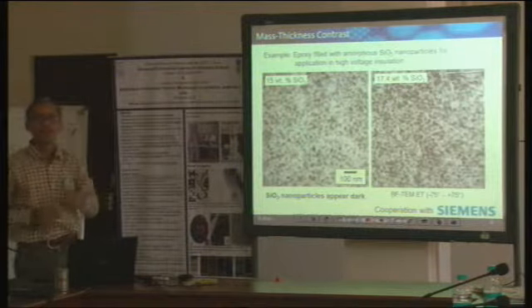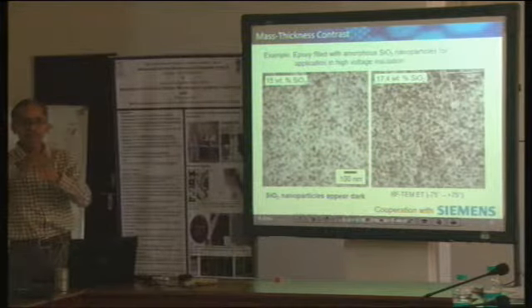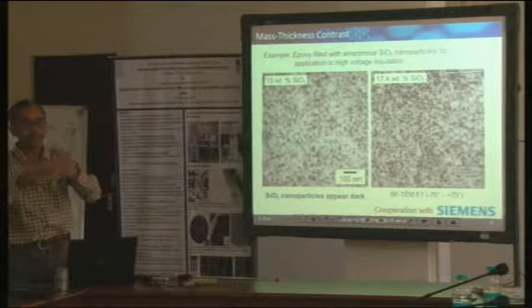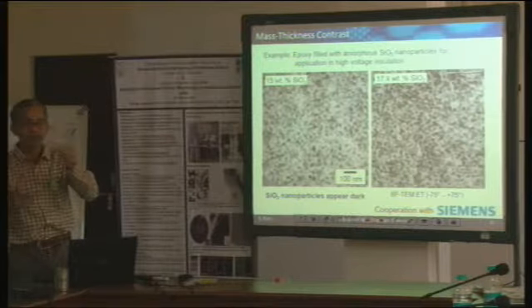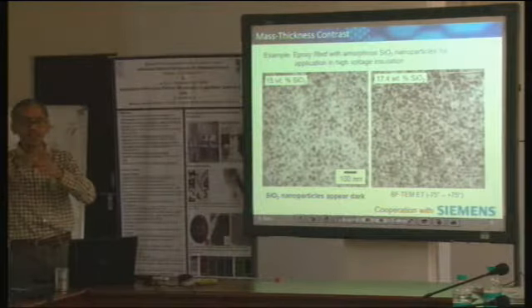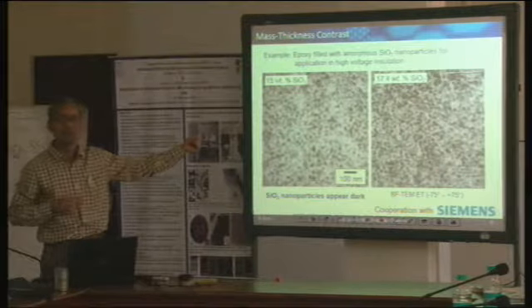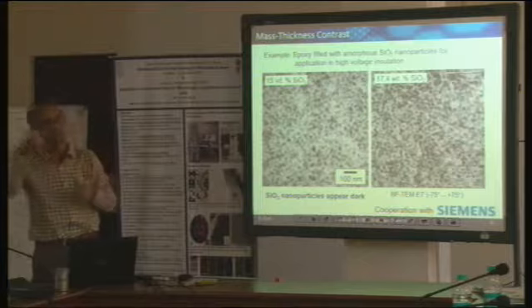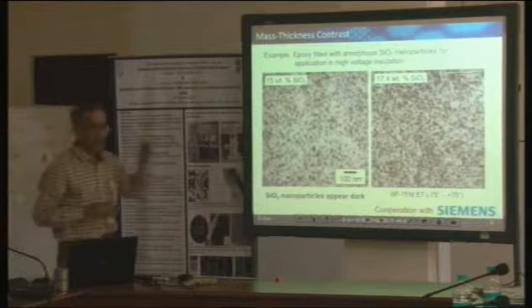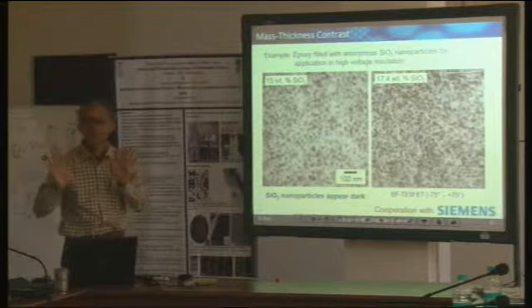But if these were crystalline, then even when I am oriented in such a way that I would have expected it to look less intense, it might look bright because it is satisfying the diffraction condition. If this diffraction contrast were to interfere with the mass thickness contrast, it would be difficult to interpret the three-dimensional tomography images, and that was the reason why they would not make it with that. Okay, so is this sensible, isn't it?